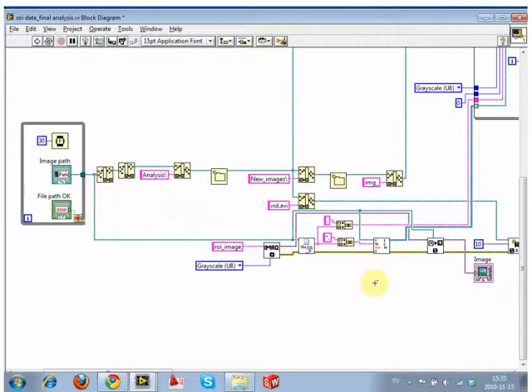Okay. It's kind of like just continually saving things inside a zip file and keeping everything together. You can have lots and lots of files, and in fact, you can put just about anything in them. I use them as containers for groups of files. So then you don't even have to call the sub-VIs to have them grouped in there. You can just put them in there if you think it's something that you might use with that kind of file.